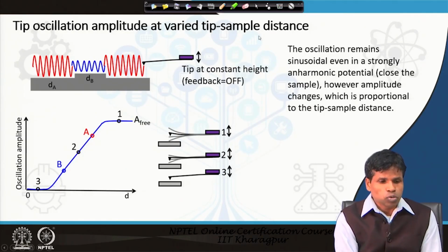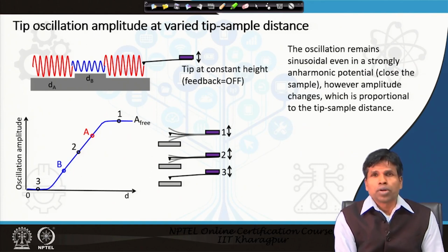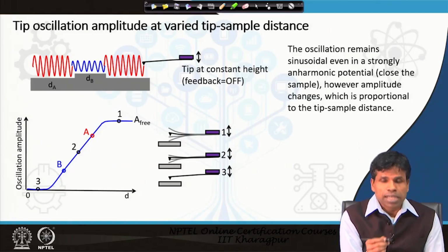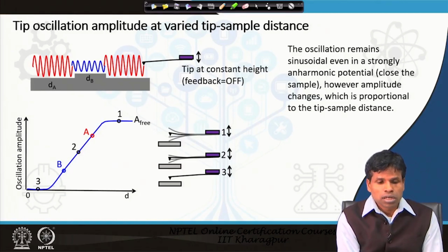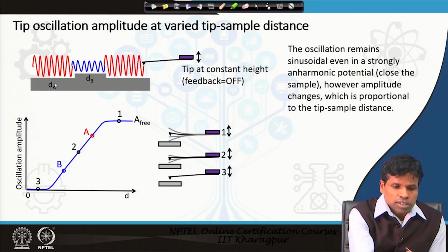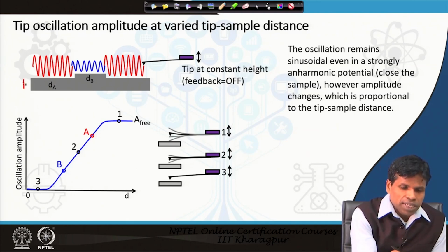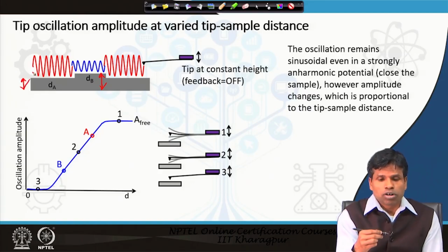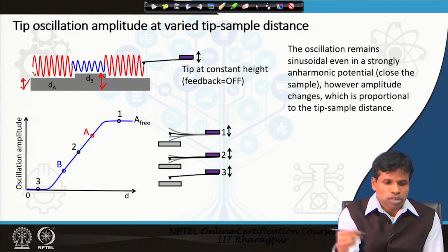You see what happens when samples of different height come in contact with the probe. Here two different average heights are taken, and the tip in this mode is oscillating above the sample surface.